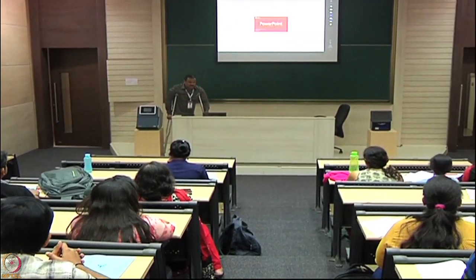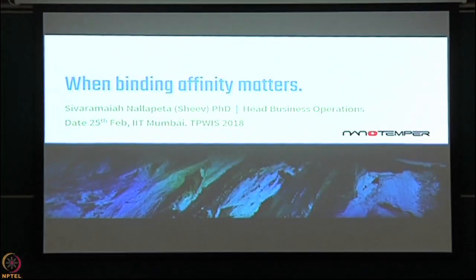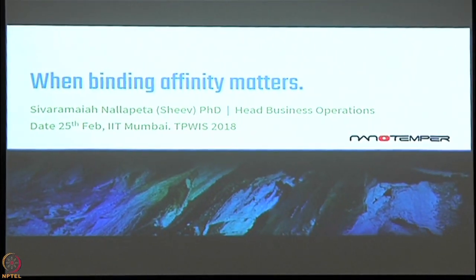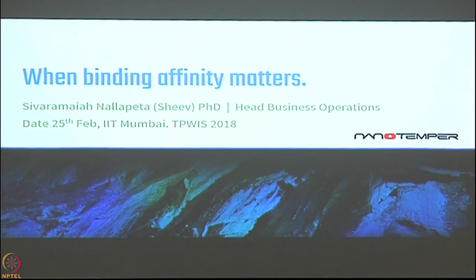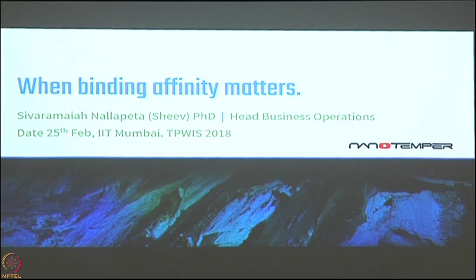I will quickly start my presentation without wasting much time, but before that I would like to know, are you doing any biophysical assays for interaction studies, protein-protein, protein small molecule? If you are working on those lines, for sure this talk should be very interesting to you. Okay, great. This is a biophysical technique that determines binding affinities. How do you determine the binding affinity between two biomolecules? It can be anything, protein-protein, protein small molecule, protein ligand, anything you can determine the binding affinity.